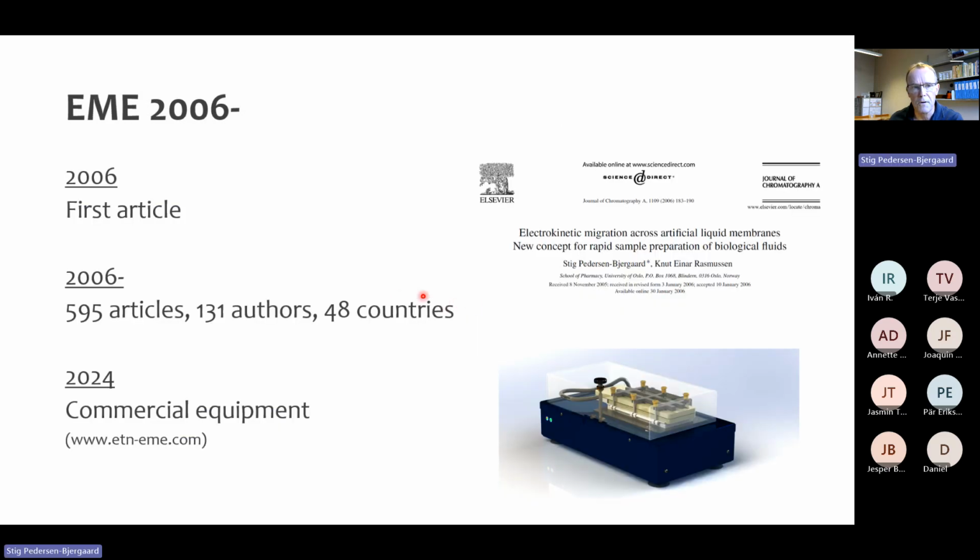The first paper on EME was published in 2006. Since that time, close to 600 articles have been published on EME in the literature. Many authors, many countries and many research groups have been part of this development. And very interestingly, last year, commercial equipment was released for EME.